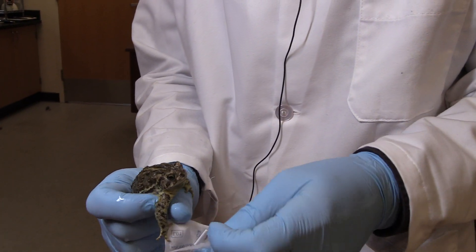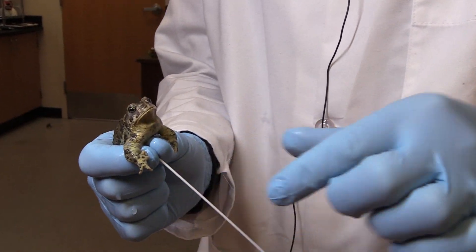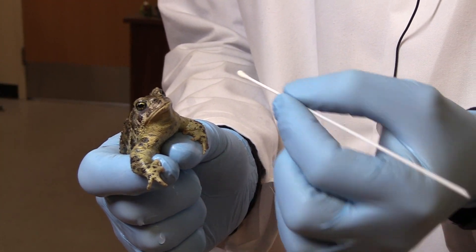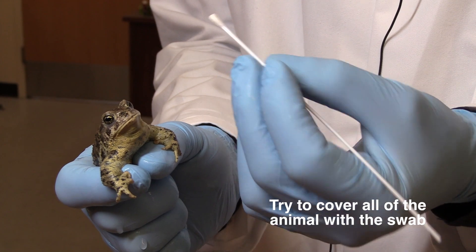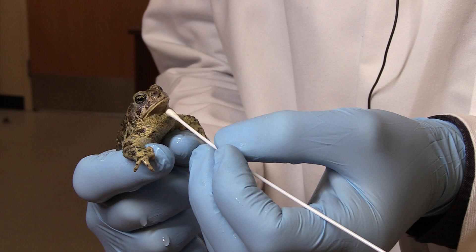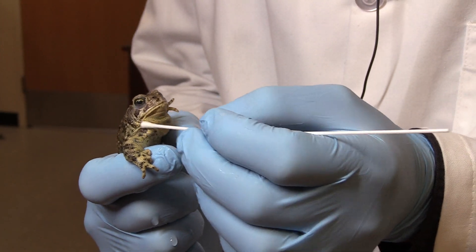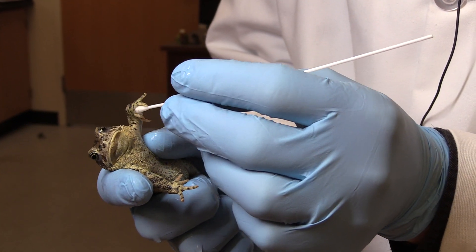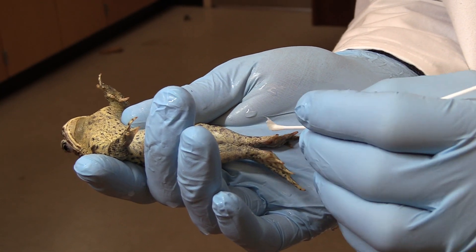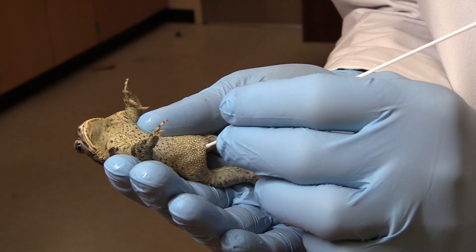The protocol for doing this is we take our little swab and we're going to slide it along the skin of the animal for 30 seconds — it's a timed swab. During that 30 seconds, I'm going to try to cover as much of the animal surface area on the outside as I can. I'm also going to try to do it right under their nares and across the top of their head, avoiding the eye — I don't want to hurt him. From his digits, under his arms, to the webbing between his toes.